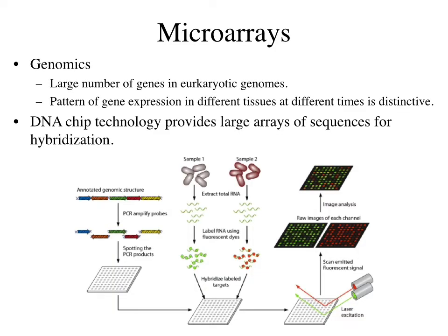A microarray is a laboratory tool used to detect the expression of thousands of genes at the same time. DNA microarrays are microscope slides that are printed with thousands of tiny spots in defined positions, with each spot containing a known DNA sequence or gene. Often these slides are referred to as gene chips or DNA chips. The DNA molecules attached to each slide act as probes to detect gene expression, which is also known as the transcriptome, or the set of messenger RNA, mRNA transcripts, expressed by a group of genes.